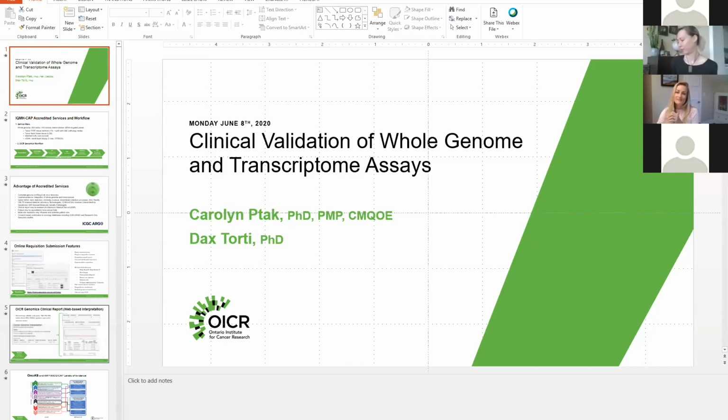Thanks, Carolyn. So we're going to offer a very standard suite of assay items, including whole genome, 80x tumor, 40x normal minimum coverage, and tumor transcriptome, along with targeted ctDNA panels. Our intake will include tumor FFP tissue section, so 10 times 10 micron slides for tumors that are the size of a pinky nail. Okay, so for larger tumors, it'll be 5 sections.